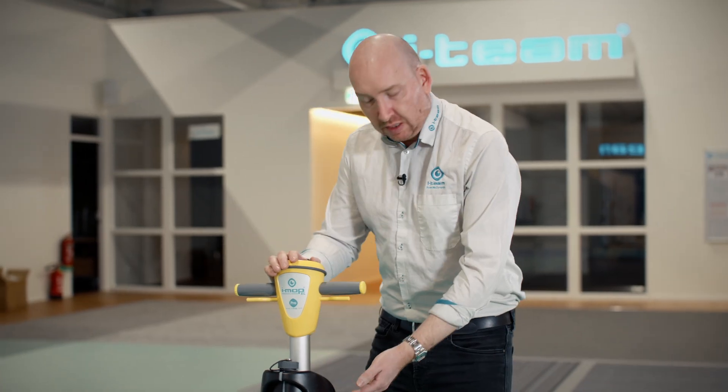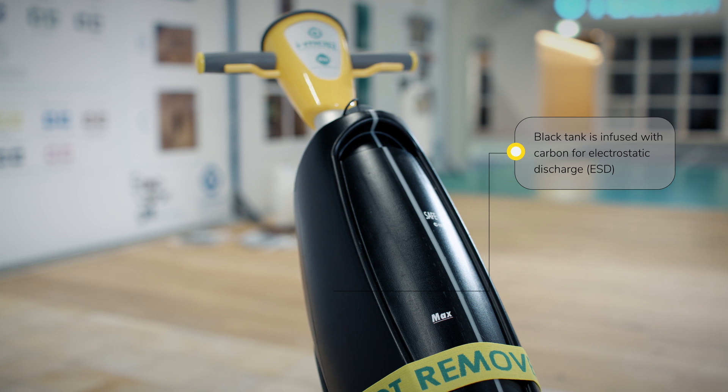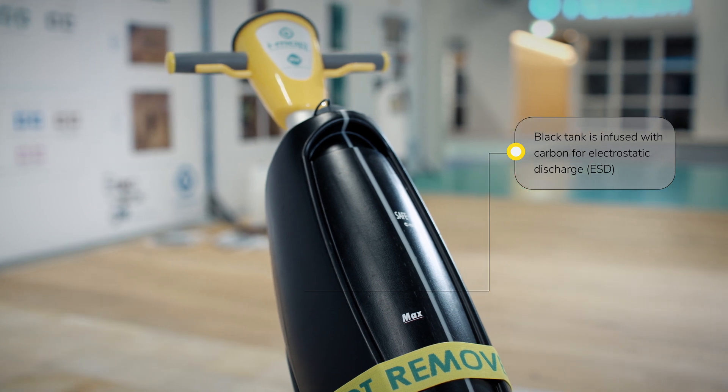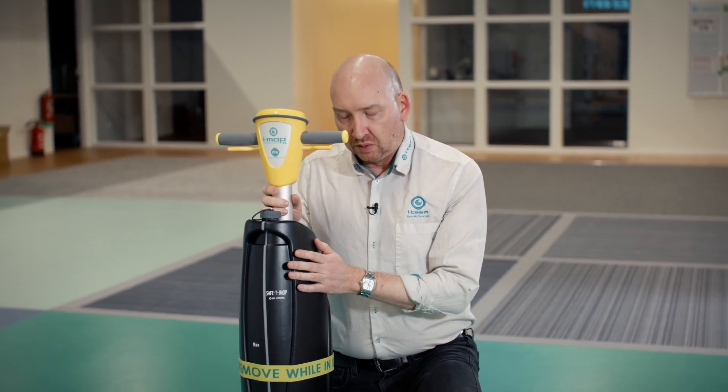Going further down, you'll see that we have a black tank. The black tank has carbon mixed into it. The carbon is for electrostatic discharge, so if there's any kind of static electricity from the top of the machine during use, it's transmitted out of the machine to ground.